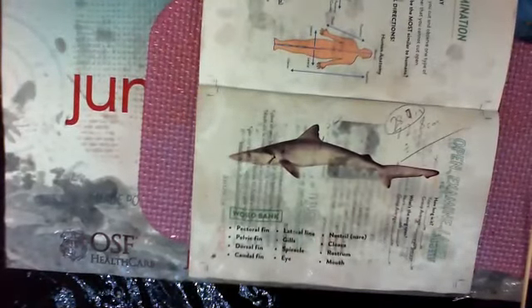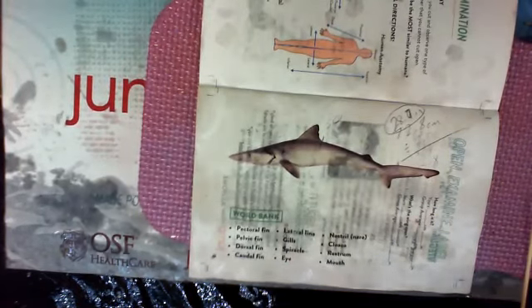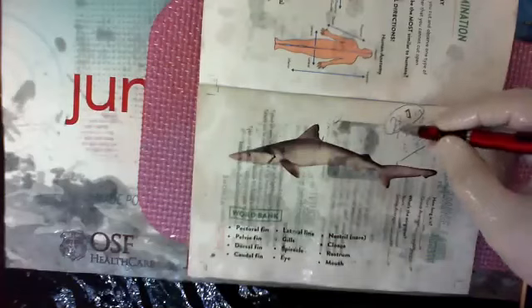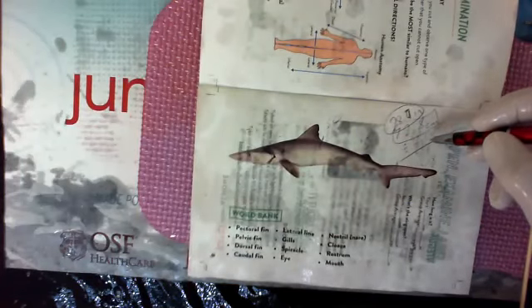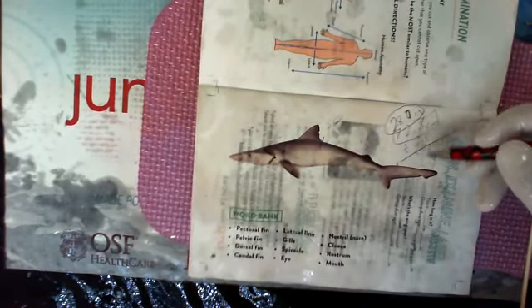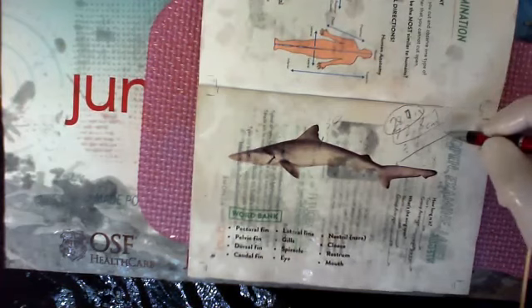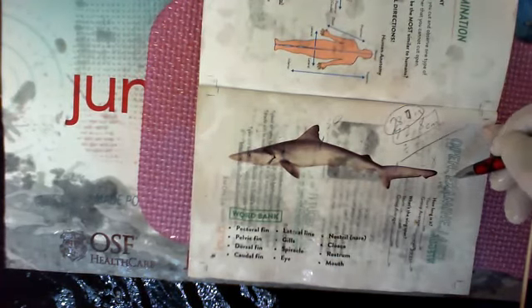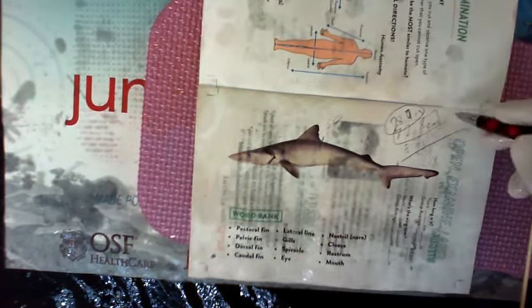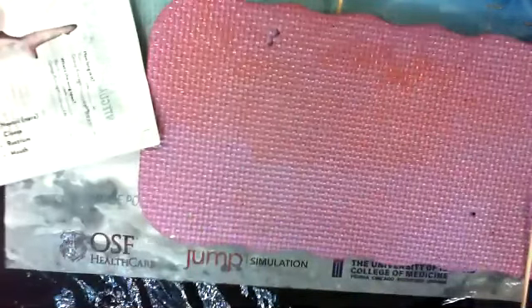If you have somebody that's helping you that can touch your computer, you can have them type your numbers up in the group chat. We're not going to calculate them now, but you can later to see how your shark compares. You just add up all of them, do it in centimeters, by the way, sorry. It's easier to get a nice round number without using fractions, like 3/4 of an inch kind of thing. So anyway, 72.8, boom. You'd add all of them up. So if we have 24 kids in here, it'd come up to 1,000 whatever, divided by 24, and it gives you the average. You can see if you have the big fish or if you're less than average.